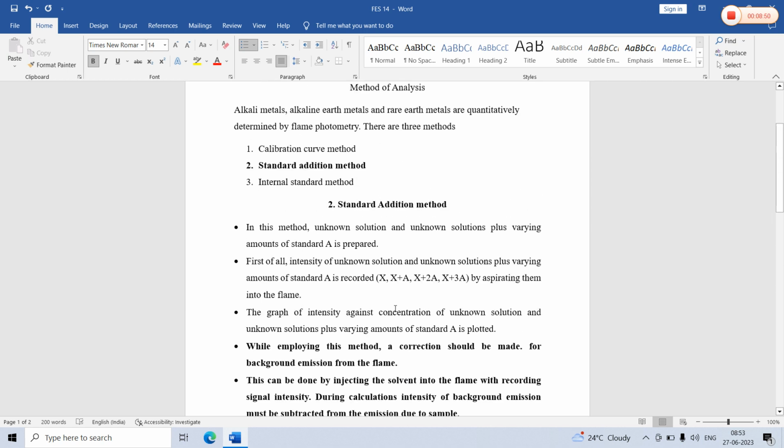So this is all about the method of analysis by the standard addition method, and how flame photometry uses it. With this content, I conclude this lecture. Thank you very much for your patience listening.